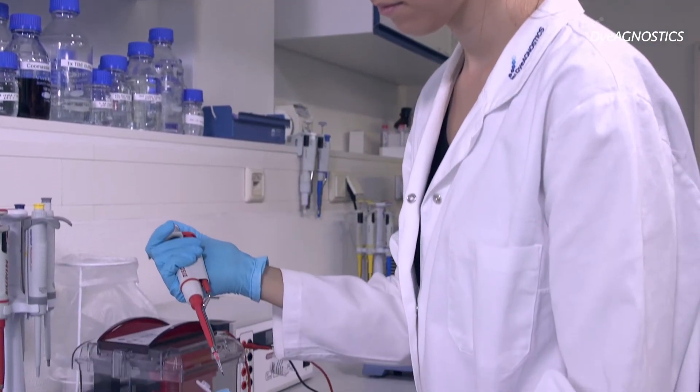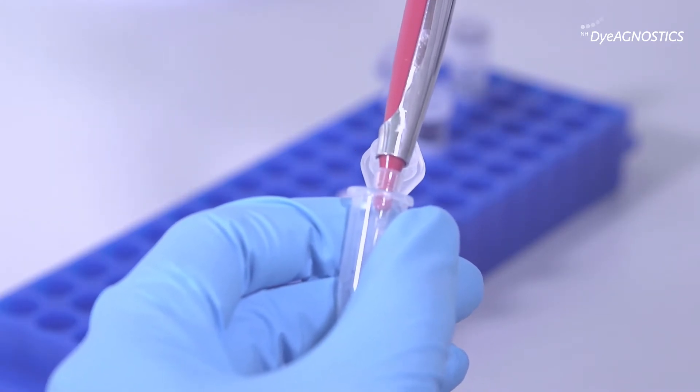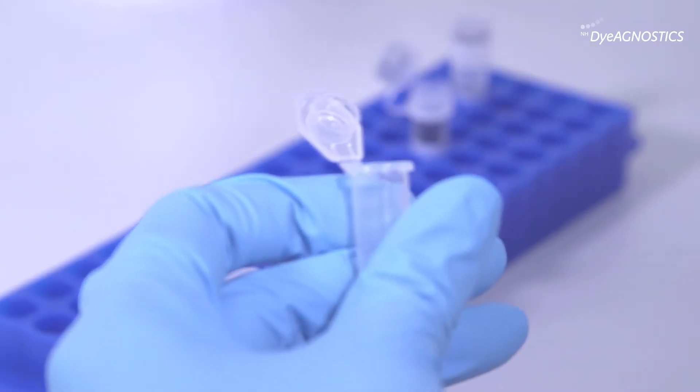Using SPL is very simple. You add the SPL loading buffer and the SPL standard to your sample, heat your sample at 95 degrees centigrade for four minutes, then run the gel and perform the Western blot as usual.